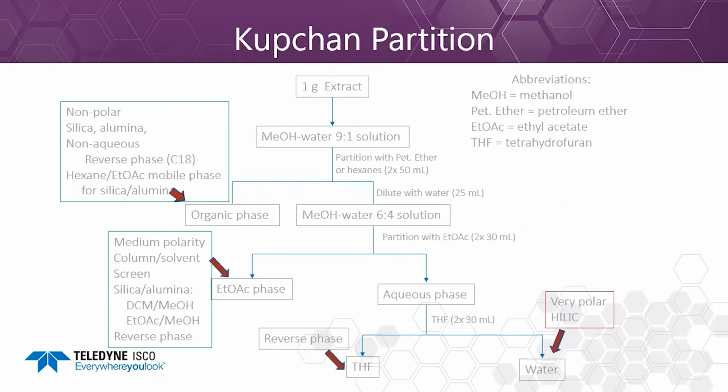Some people add 1 gram of sodium chloride prior to the THF extraction, which increases the polarity of water. It's essentially the salting out effect. Consider using ammonium chloride instead. This is a volatile salt, and so it will tend to leave your extract as you lyophilize it.